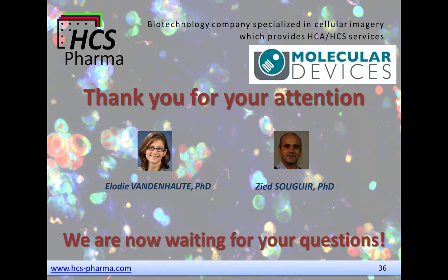In fact, it's a great way to see deeper into tissue. There are several different tissue clearing methods out there. We have worked with Visikol in the past, but yes, this is a great way for seeing clearly into thicker 3D organoids.